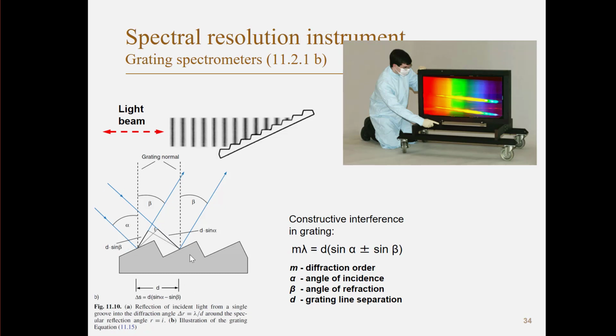And if we now look at the light which leaves after this point here, along this line to a target infinitely far away, they have the same distance. So the difference in distance traveled is that this line which we draw here travels this much further, and this line over here travels from here to here further. If we want to look at the difference in these two travels, we take this distance, from here to here, which is given by d times sine alpha, where d is the distance between two grooves, minus this distance, which is in black here, which is d sine beta.